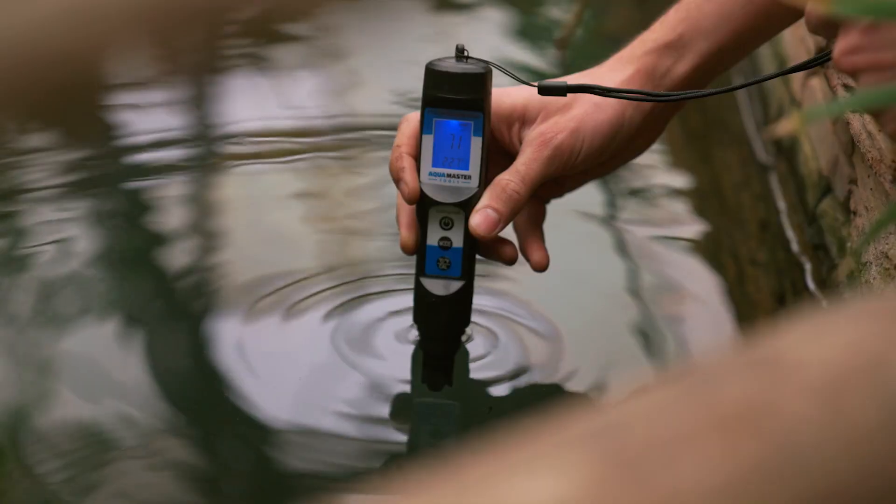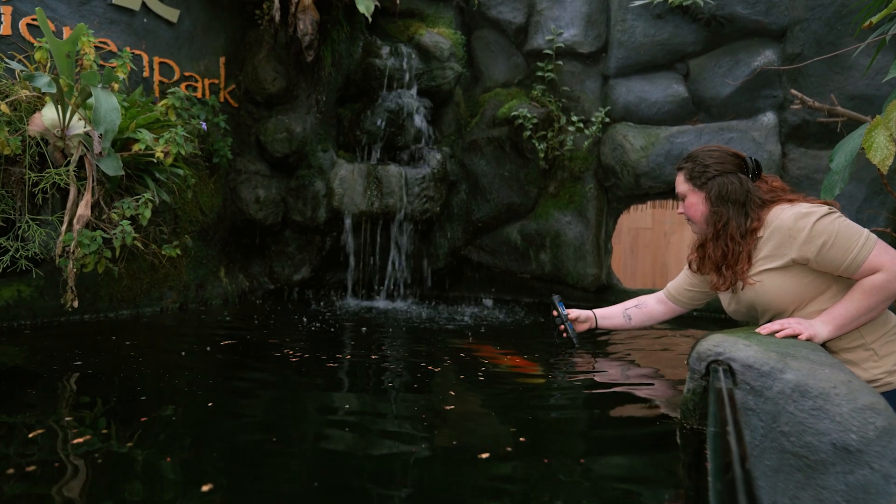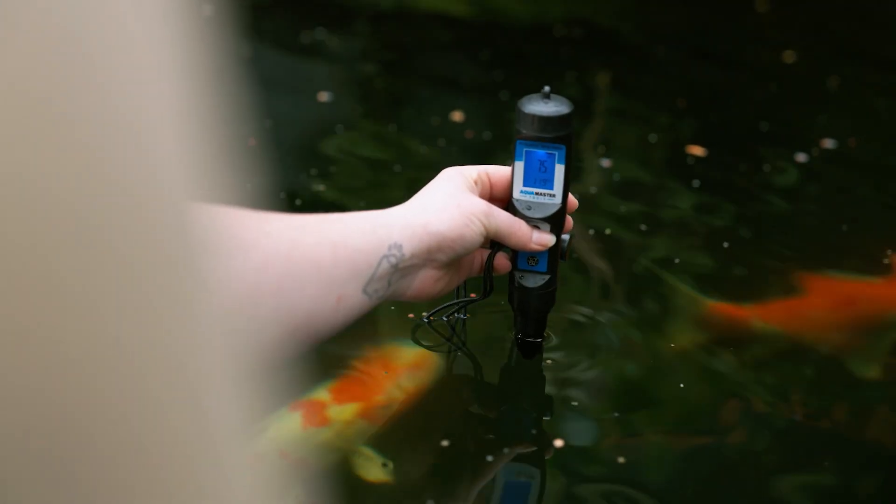It all started six years ago with a digital 3-in-1 meter, and what you have in your hands now is the result. There was a lot of development on our products over the years in terms of the housing, the quality of the probe, the circuit boards, and all the data behind it.